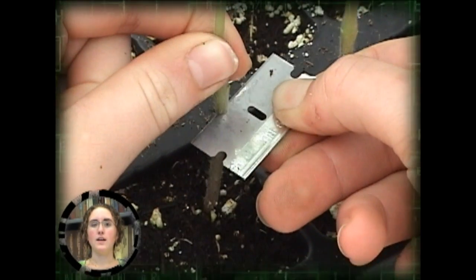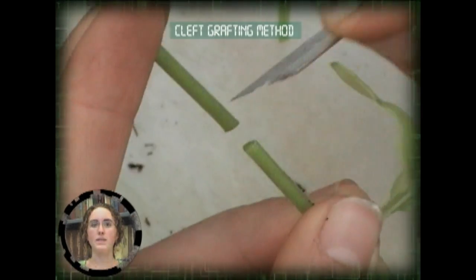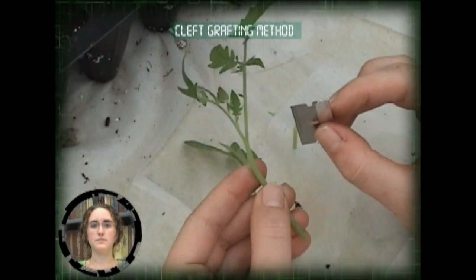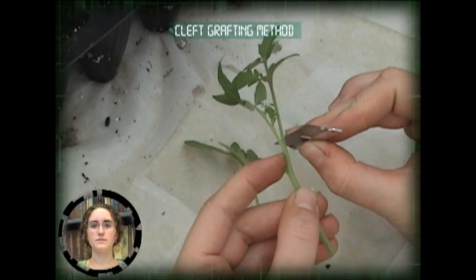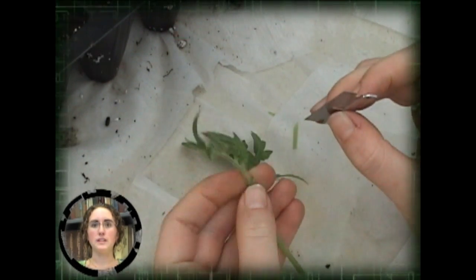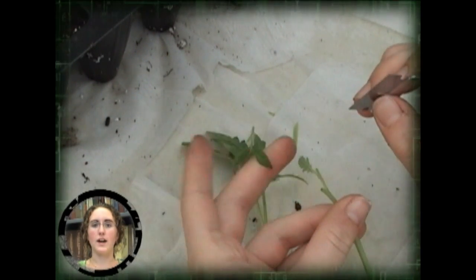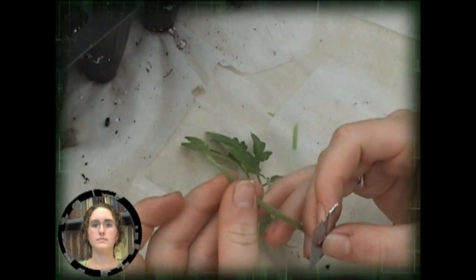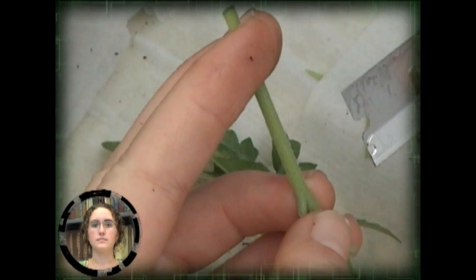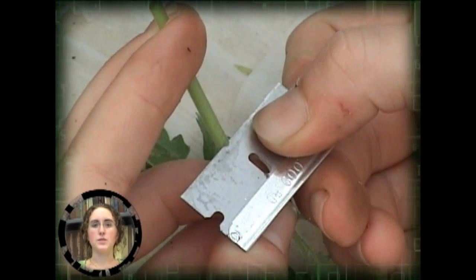For the cleft graft method, the root is decapitated and the root removed from the scion by cutting horizontally. The leaves of the scion are pruned leaving only the meristem intact. This will reduce water loss from transpiration while the graft heals. The scion stem is then trimmed into a wedge.